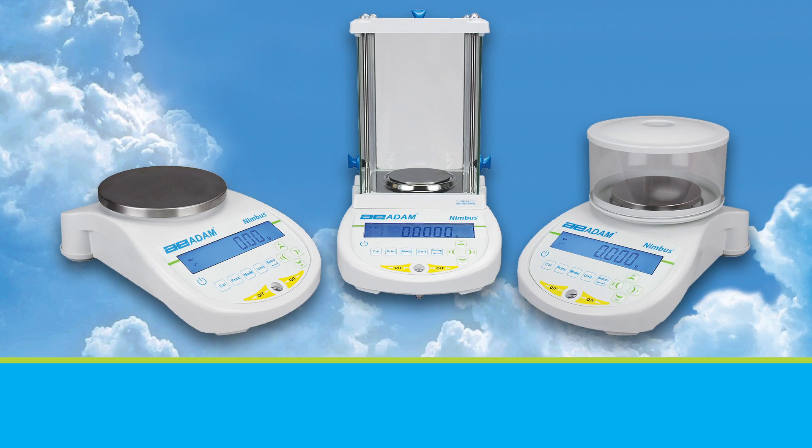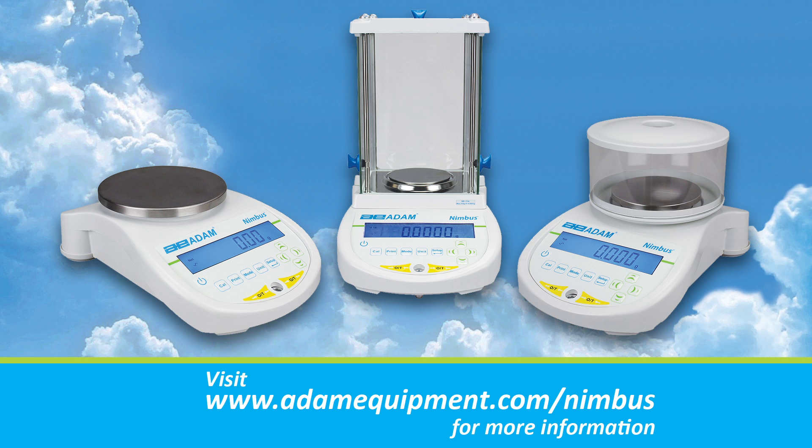For precision weighing, the Nimbus is designed to weather the storm in demanding laboratories. Experience the Nimbus by Adam Equipment.